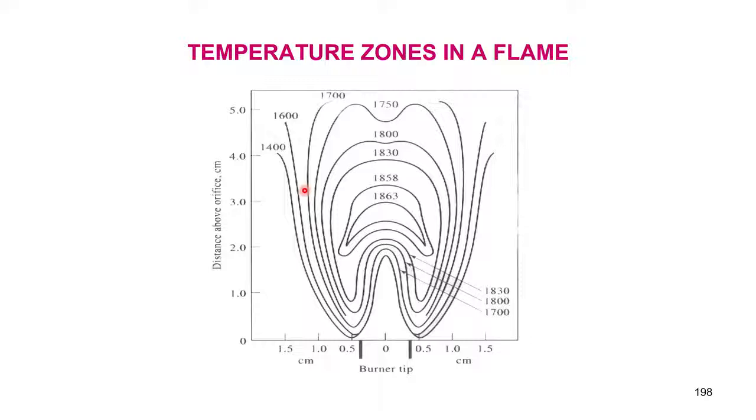So, if this is the burner tip, you see here on the x axis 0 to 0.5, and these are in centimeters.